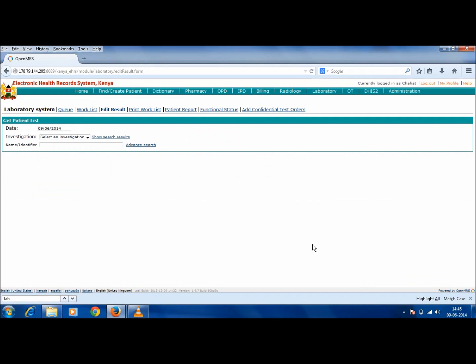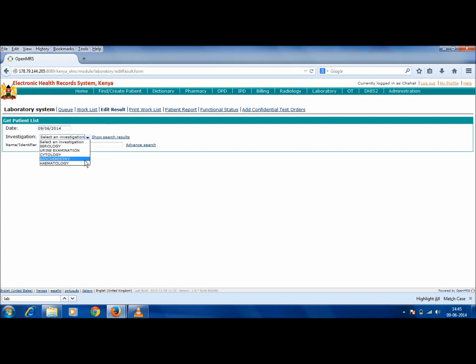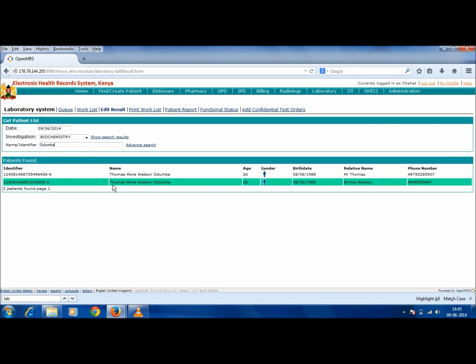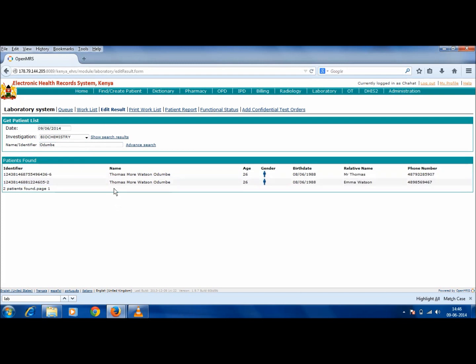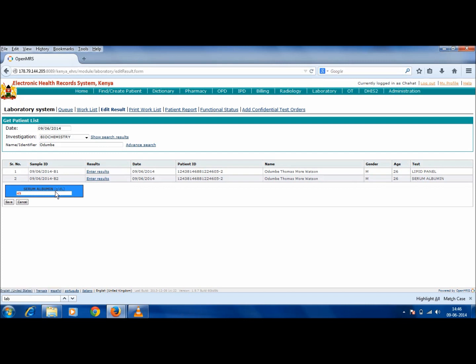The next tab after Work List is Edit Results. Click on Edit Results and fill in the date and investigation from the drop-down menu. Type in the name of the patient for whom the result has to be edited. From the list that appears, click on the patient's name or identifier. Now say for Serum Albumin, the value that was entered was wrong and needs to be edited. So click on Enter Results and you can change the value here. The same must also be saved in the system by clicking on Save.